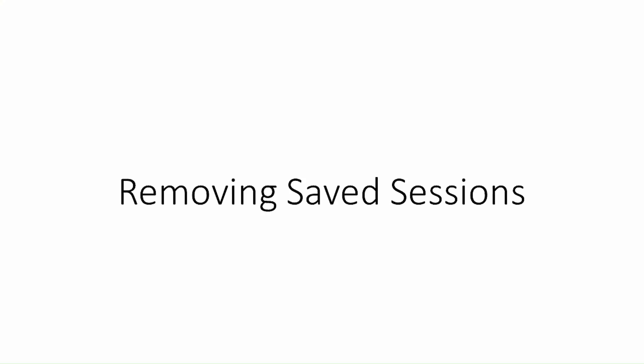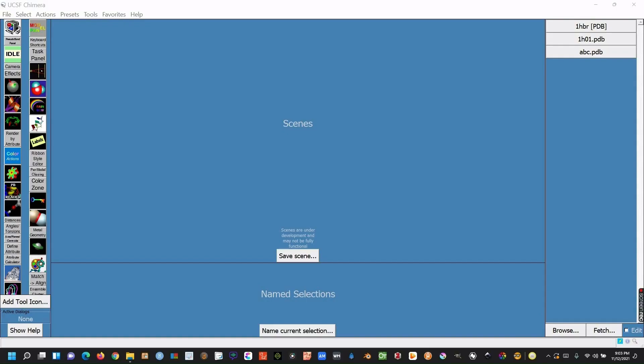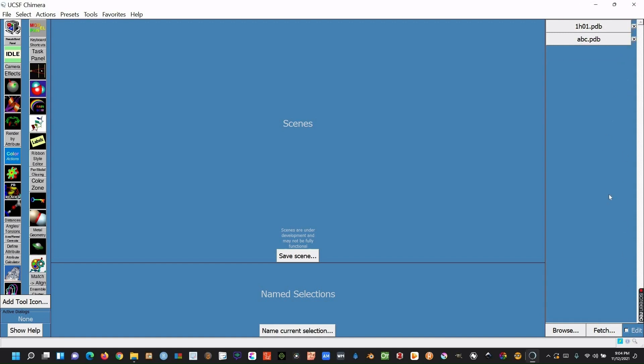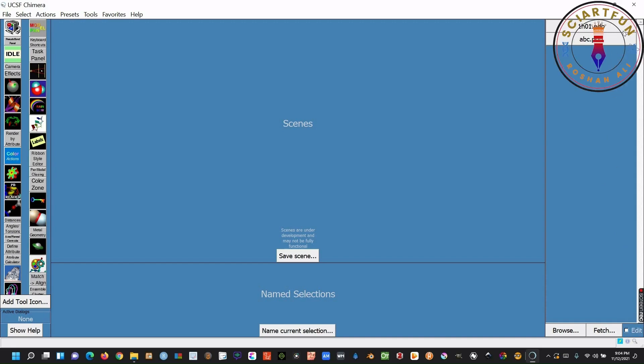Our next objective is to remove the objects from the history. To do this, you just need to check this edit box first. Now click the cross of any object you want to remove from the history. That item will disappear from the window. Once the items are removed, uncheck the edit box.